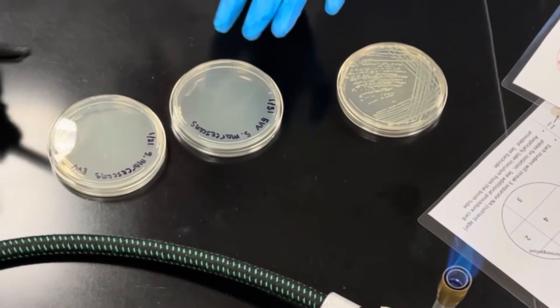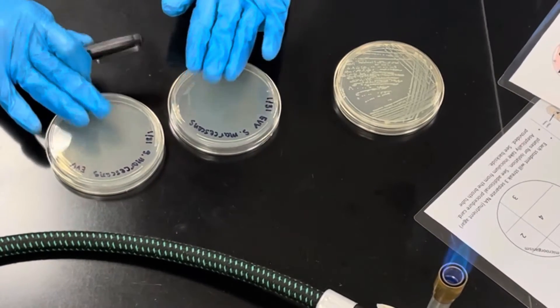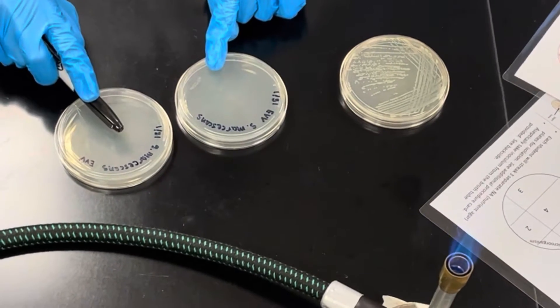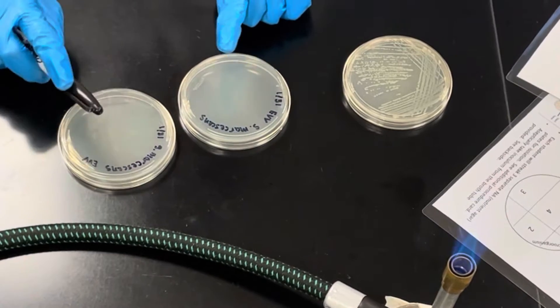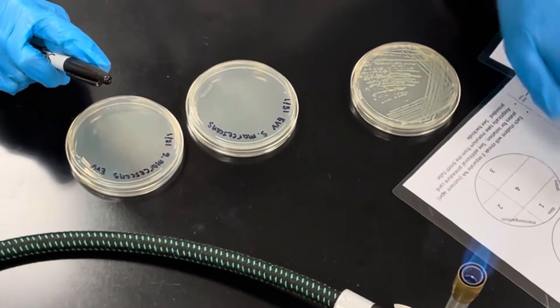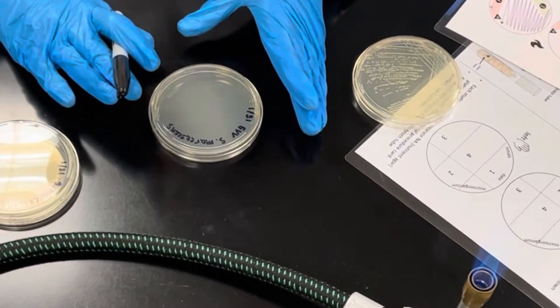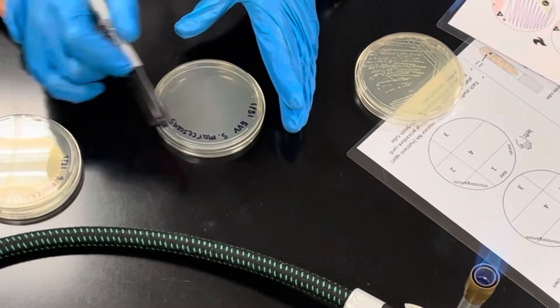Remember when we have plates, we always label the bottom side with the date, your initials, and then the name of the organism. You have your table directions over here.